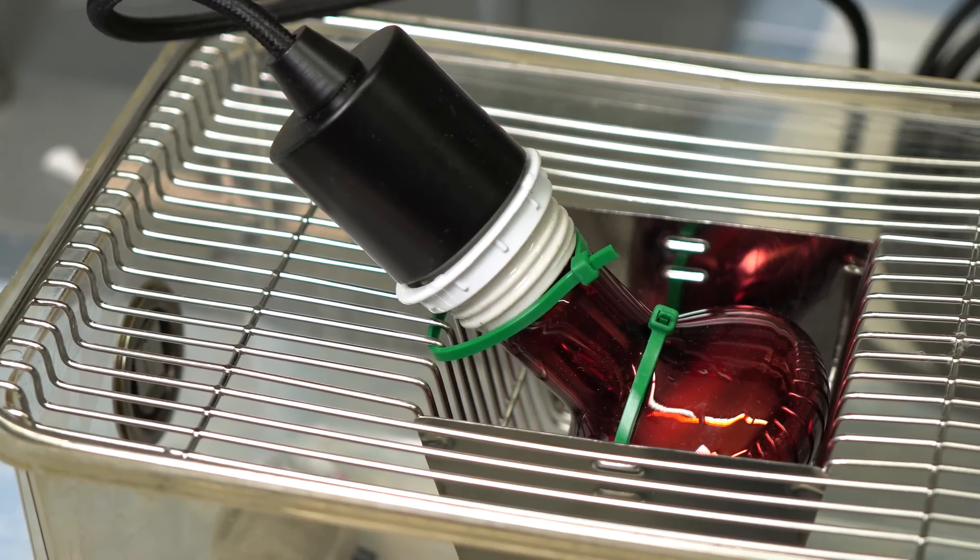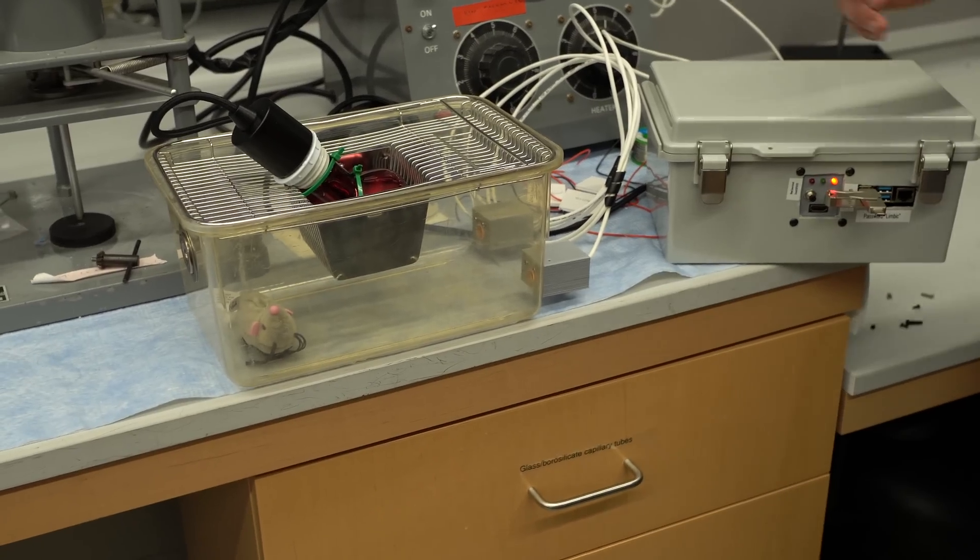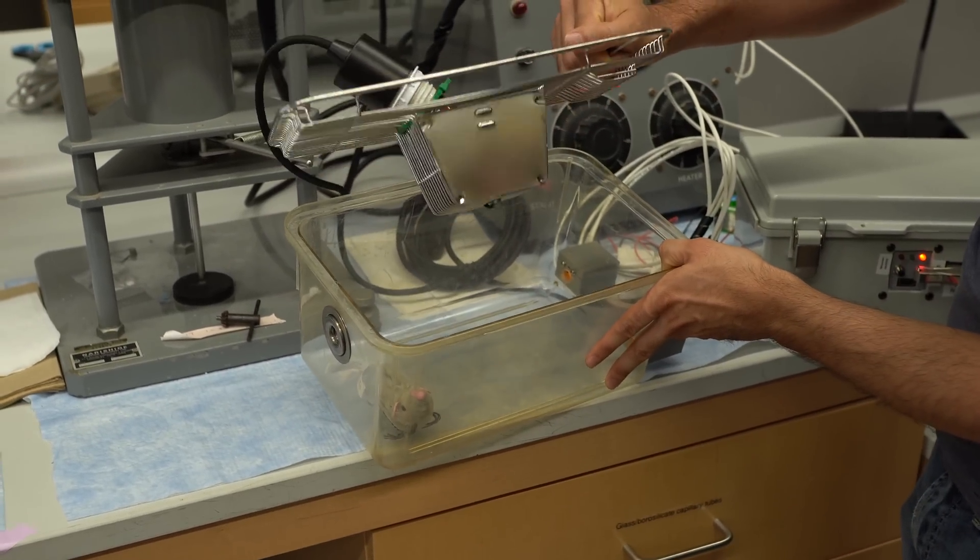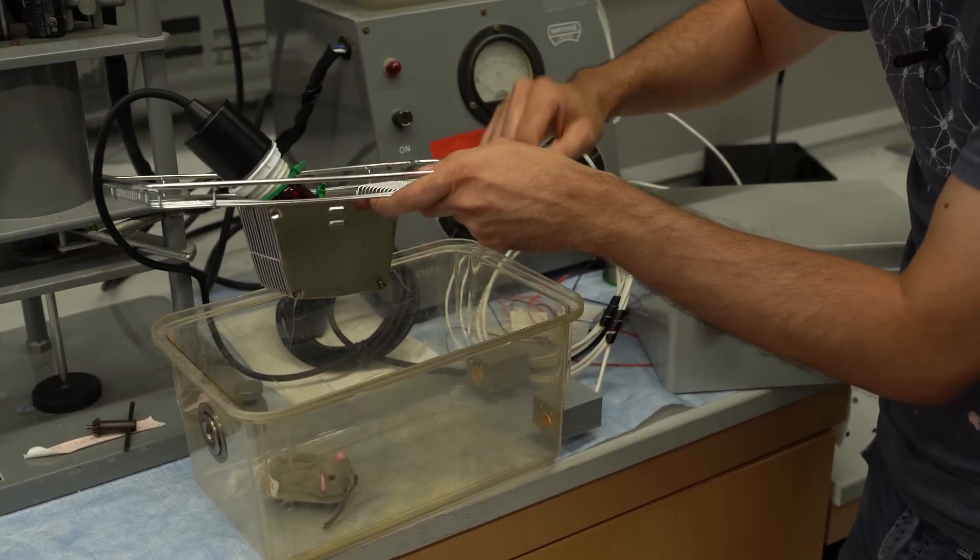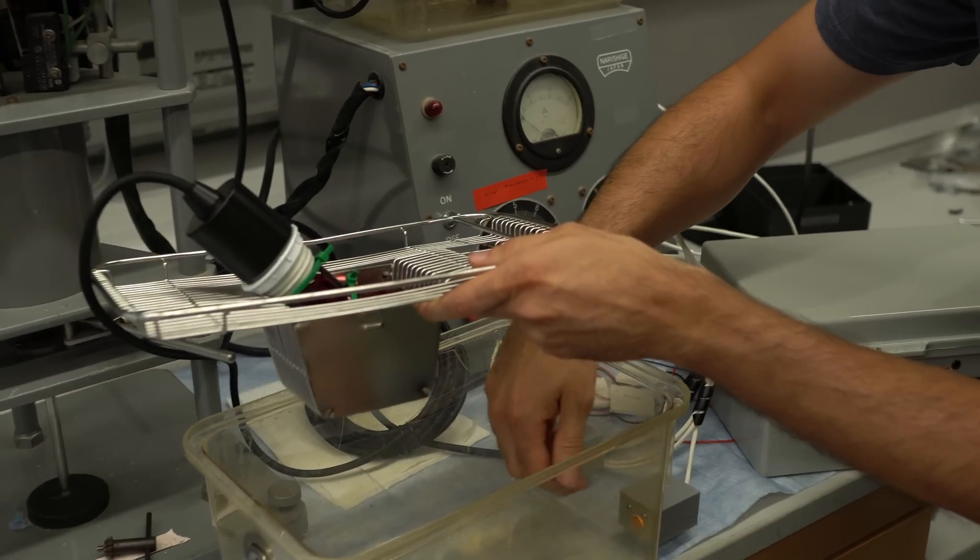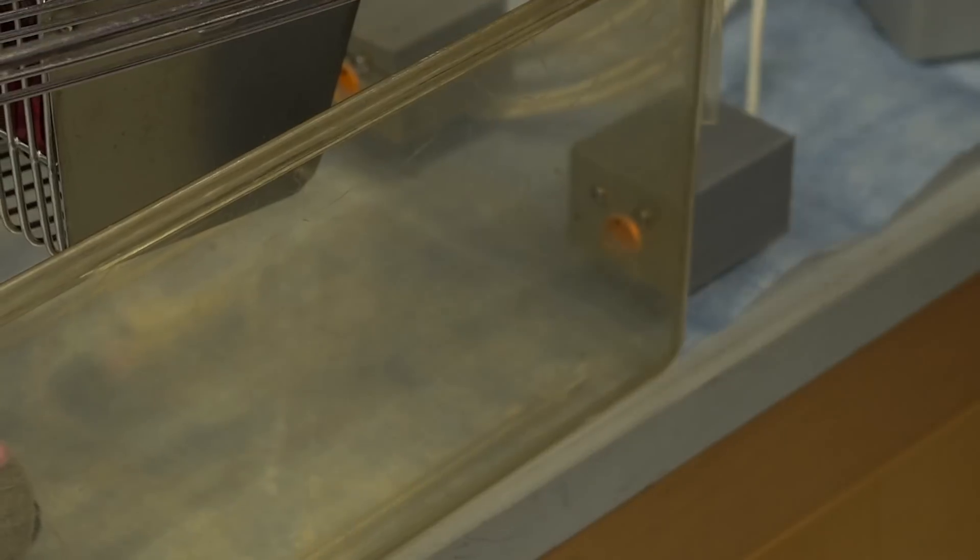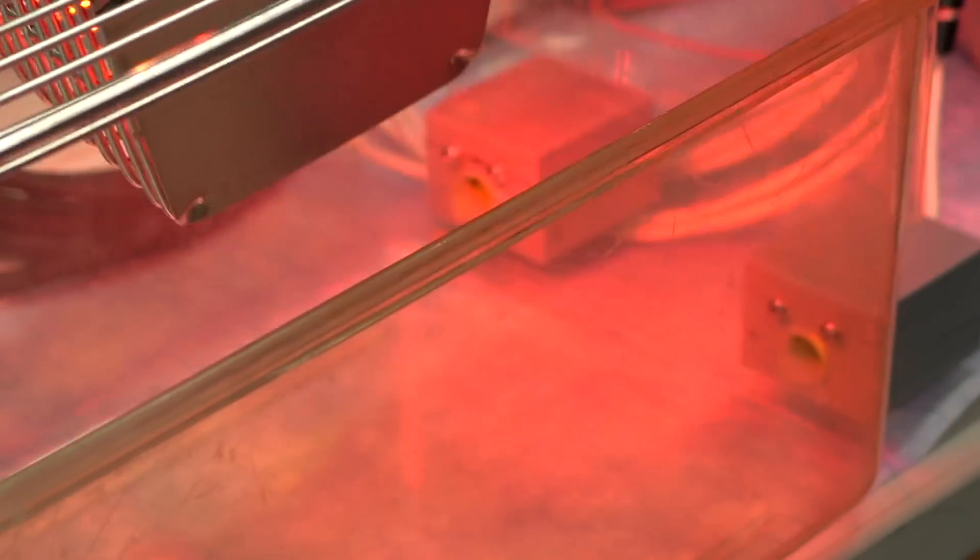So this is our operant heating chamber. This is what we use to test how the mice learn. And so the way this works is pretty simple. So inside of here is a nose poke. So the mouse can run around in here just like this, and he can stick his nose into either of these ports. And if he sticks his nose into this port, nothing happens. If he sticks his nose into this port, then the heat lamp comes on.